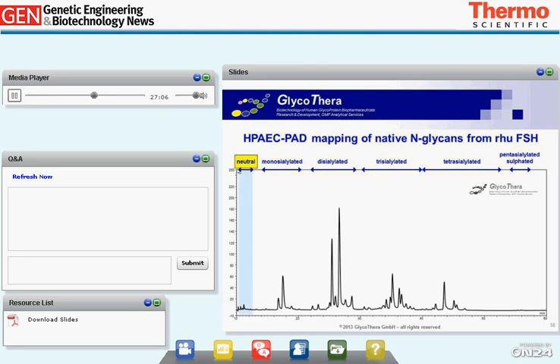For screening of unwanted potential antigenic structures within the neutral glycan group, which corresponds to about 1.5% of total N-glycans, we used a different strategy. This time, the neutral glycan structures were collected during the analytical HPAE-PAD analysis using a carbohydrate membrane desalter device, followed by fluorescence 2AB labeling and normal phase HPLC with fluorescence detection.